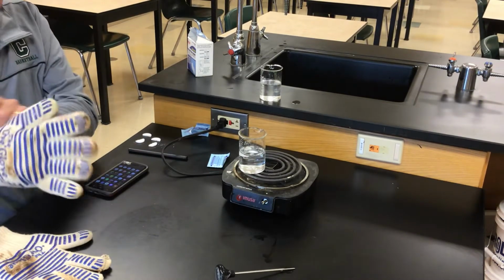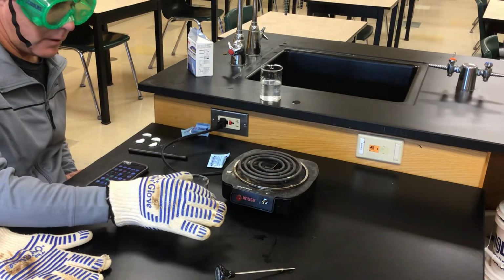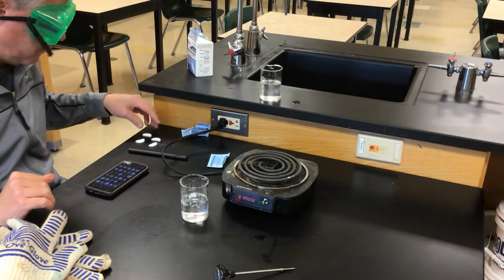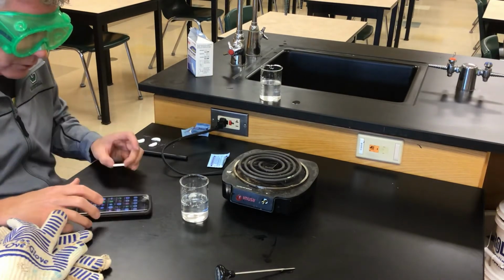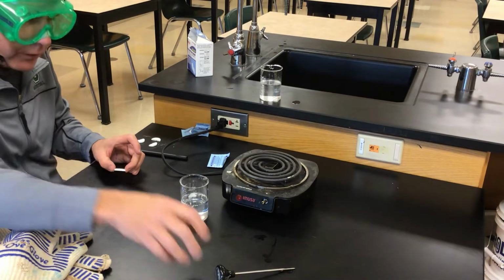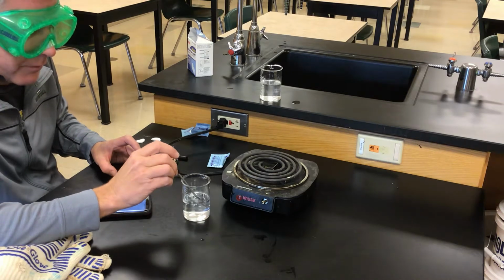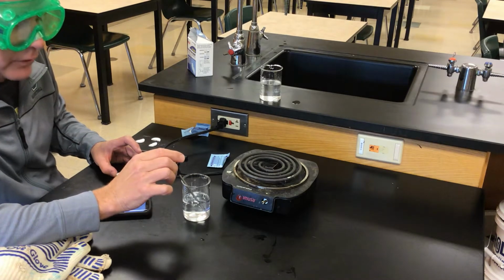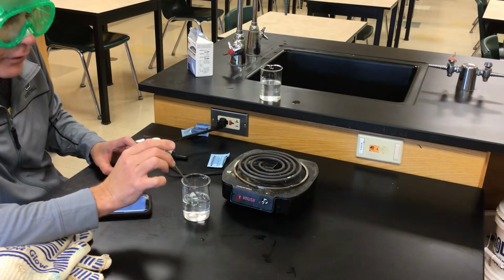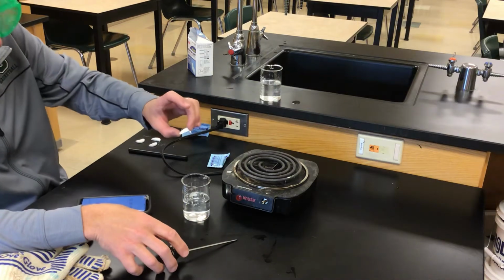So the first temperature we're going to do is 35 degrees Celsius. Remember, we already did 20, room temperature, as our control. So now all we're going to do is time how long it takes this. We'll record the temperature to make sure it's still 35. And it's actually 36, it's 37. So that's the temperature we'll do our next one at too.